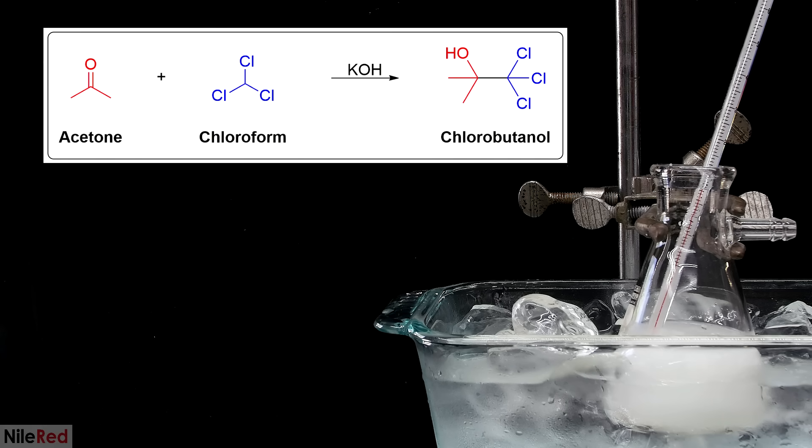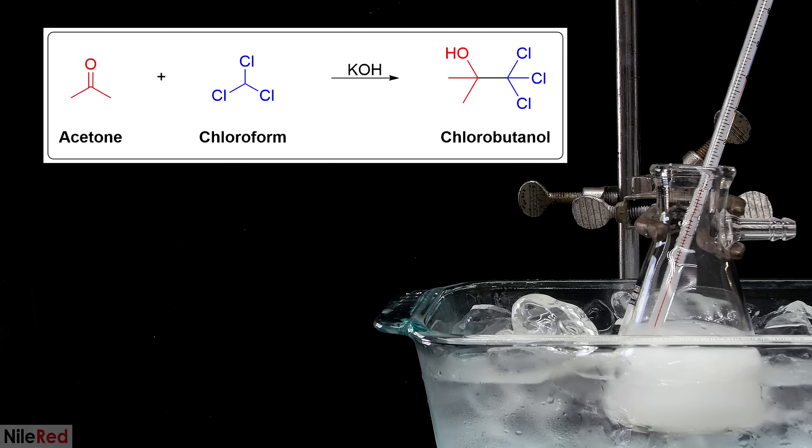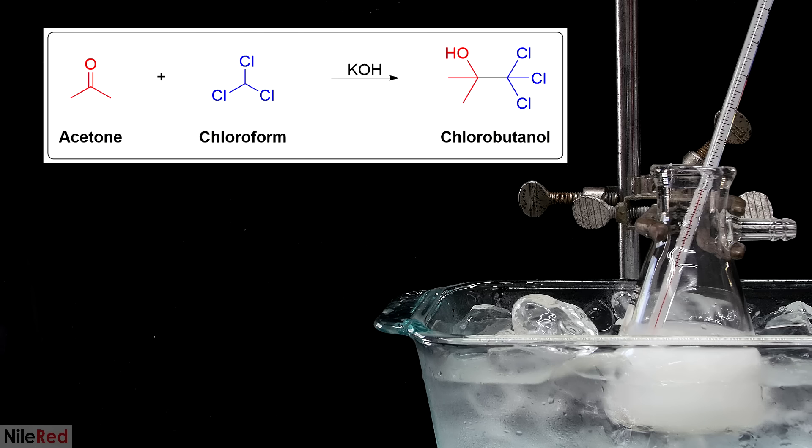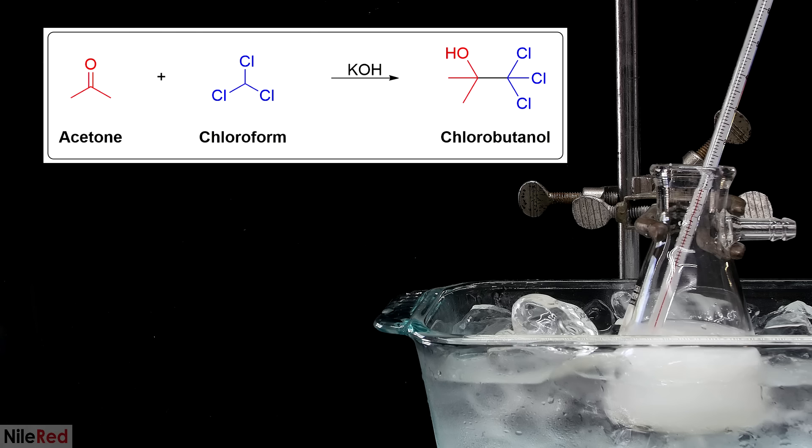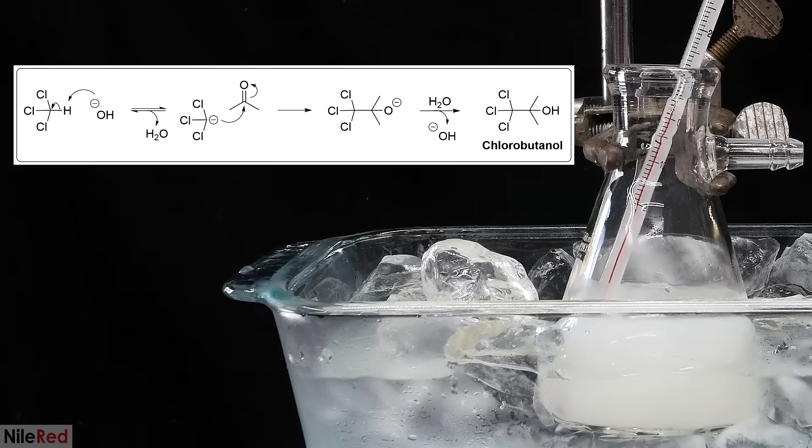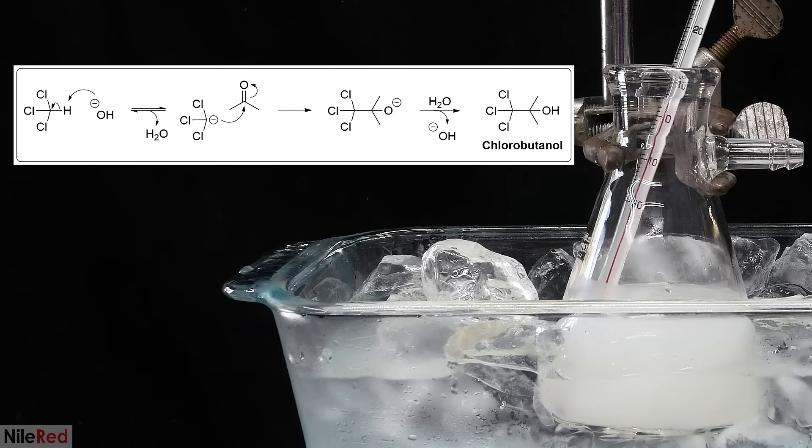What's going on here is a base-catalyzed reaction between acetone and chloroform. The acetone is used in a large excess, and it dissolves the chlorobutanol as it forms. The solid white stuff that we see floating around is just finely powdered potassium hydroxide. I couldn't find a proper resource for the mechanism, but this is probably what's going on.